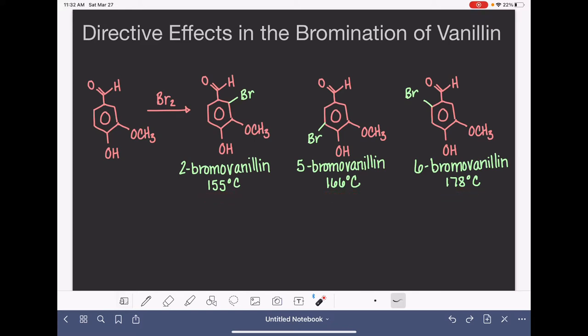The synthesis itself is going to be really straightforward, but before we jump into the reaction, I want to talk a little bit about the electrophile, the bromine. In our textbook, we learned that bromination is done using the bromine molecule and a catalyst like FeBr3 or AlBr3, but the bromine molecule is pretty unpleasant to work with. It's super toxic.